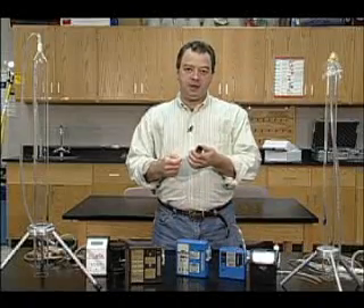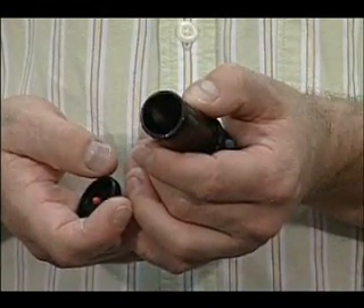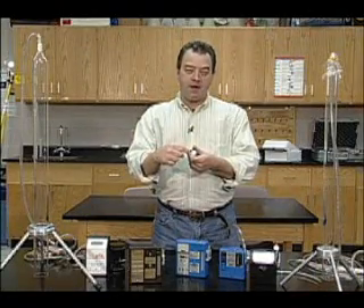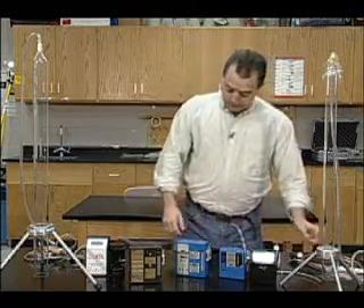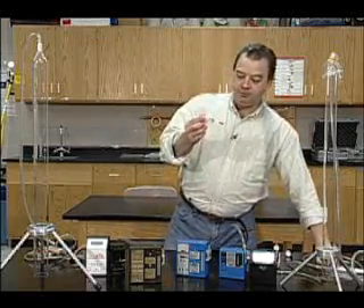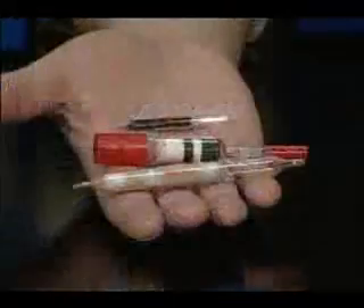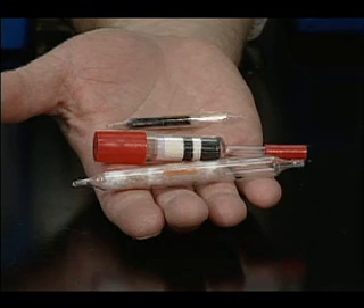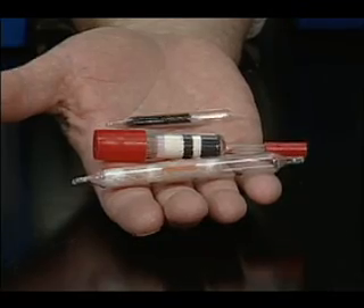Next is an open face cassette, and this is used for asbestos. It's open face so you get an even distribution of the fibers on the cassette. Then when they analyze it in the lab, they take out a pie slice and count the fibers. For gases and vapors, we use tubes. We have different types of tubes, the most common being a charcoal tube. All tubes have a loading section and a backup section, and if there's more than a certain amount of the sample on the backup section, the sample is void.